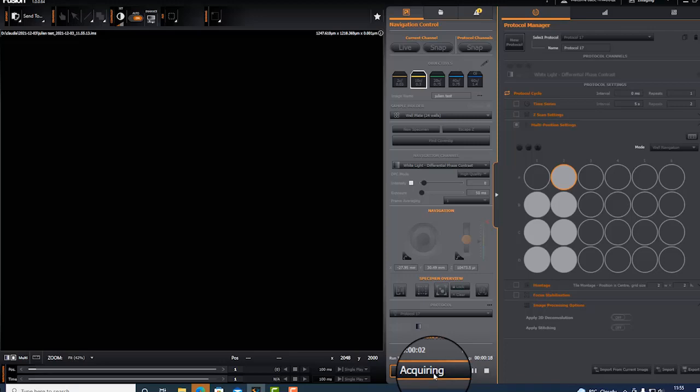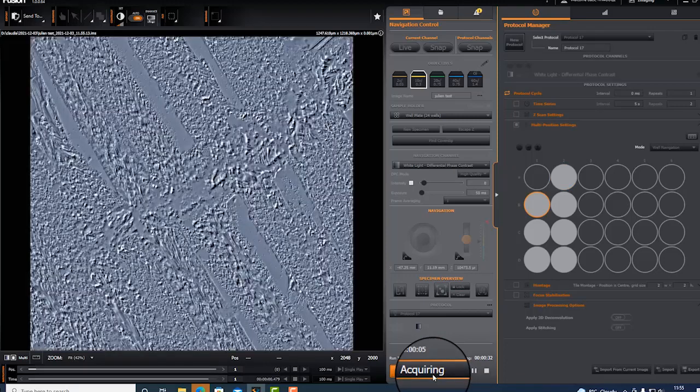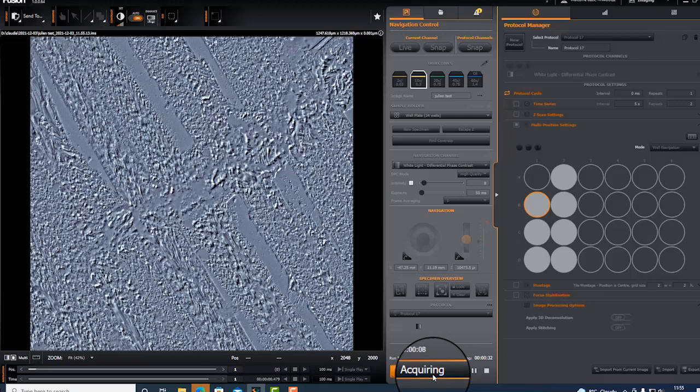It will run and acquire all seven positions in this 24 well plate.